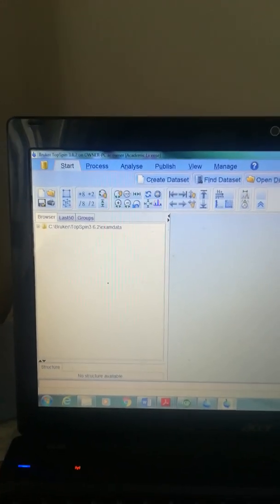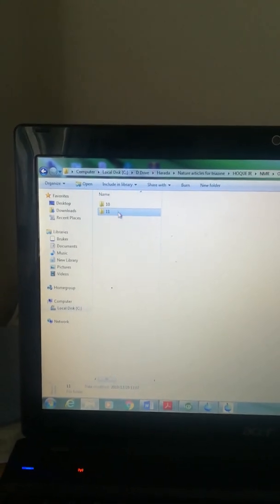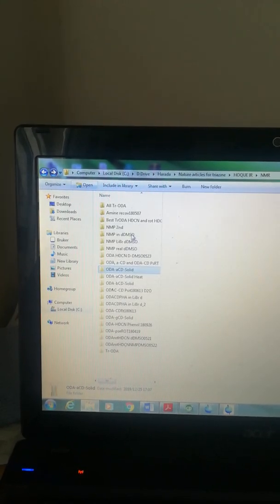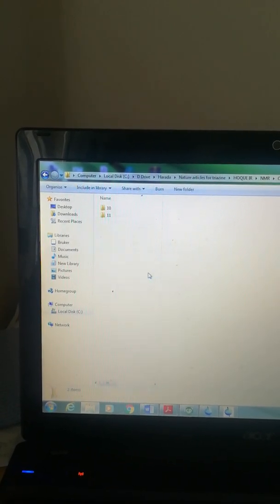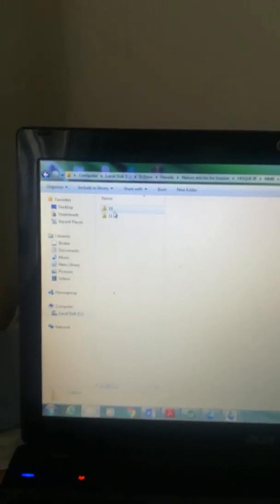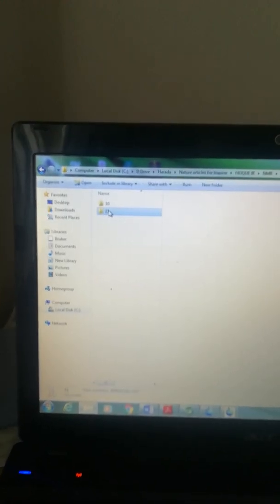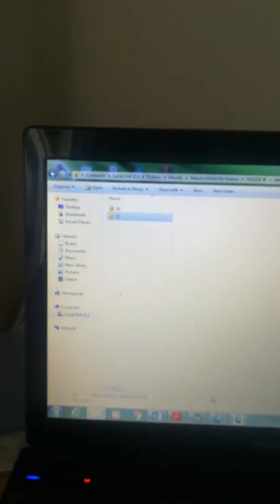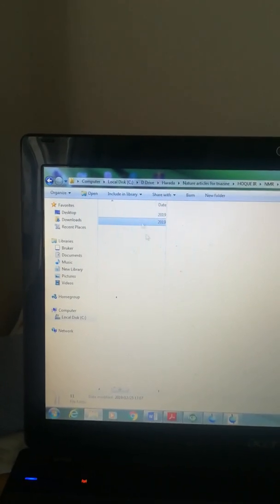I already have TopSpin software open. Previously I saved the NMR file which has two files inside: 10 and 11 — 10 is proton NMR and 11 is carbon-13 NMR. Just click and drag it into the TopSpin software.